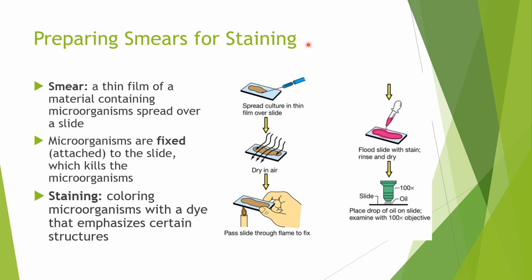So first of all, what's a smear? A smear is basically a thin film of microorganisms spread over a slide.